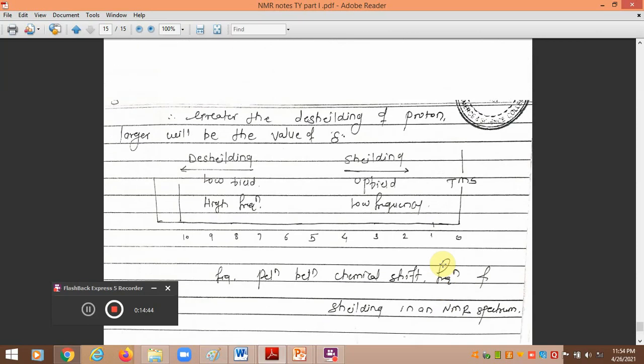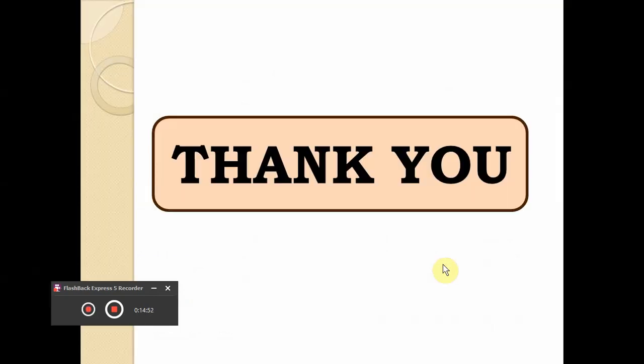Dear friends, in the next part of the video, you can get the information about the structure of the molecule based upon the position of peaks given by the different protons of the molecules.